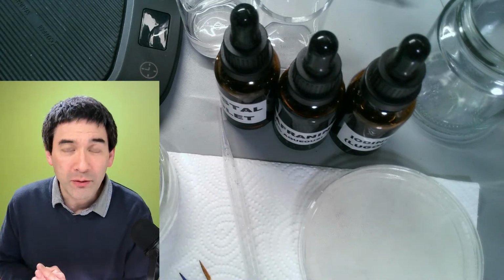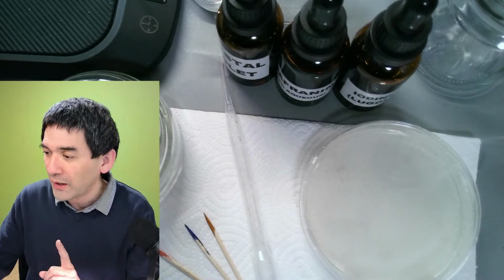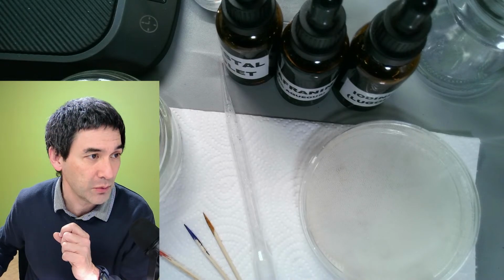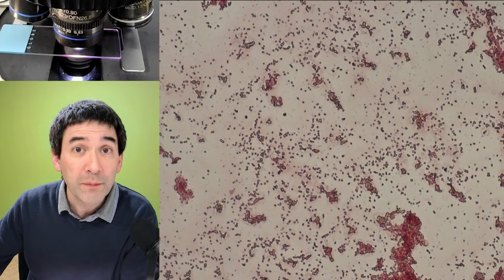So what am I going to do? Before I explain to you all of the materials and everything that we need here, I'm going to quickly show you now a live view under the microscope to actually show you what a Gram staining of bacteria actually is. Okay, so let's have a look at the microscope view, and I prepared already this morning, my time, a slide with bacteria.